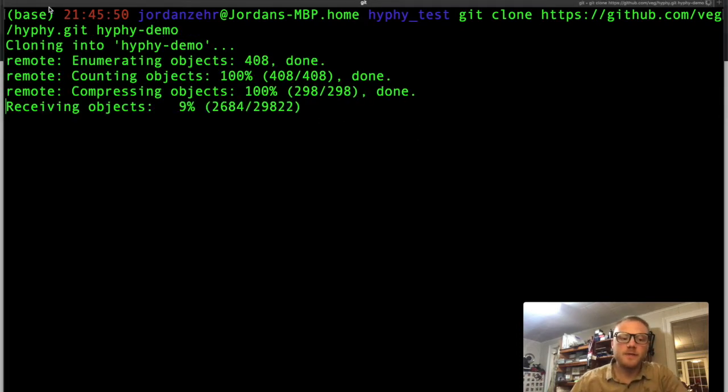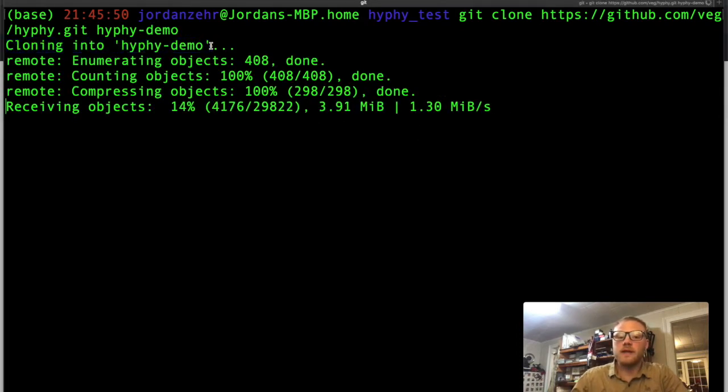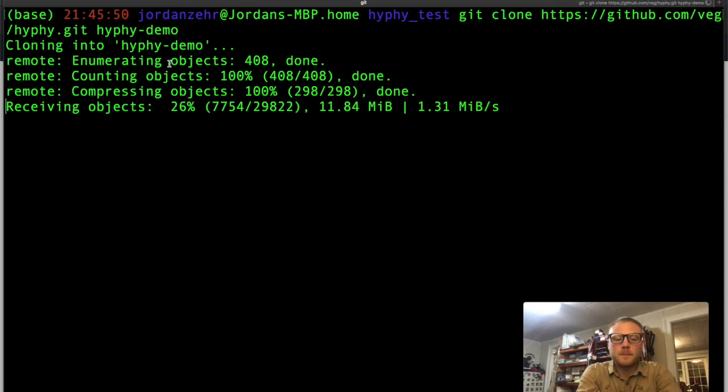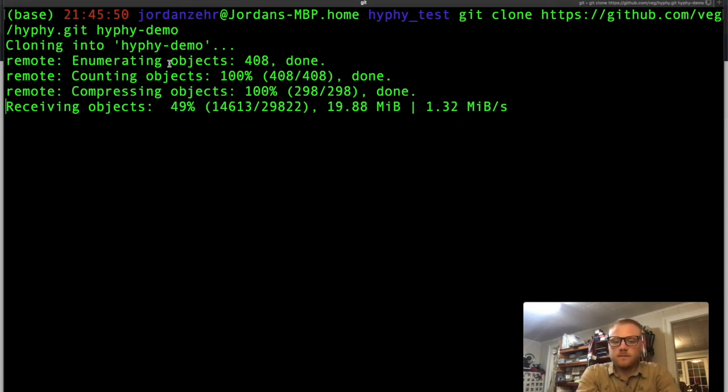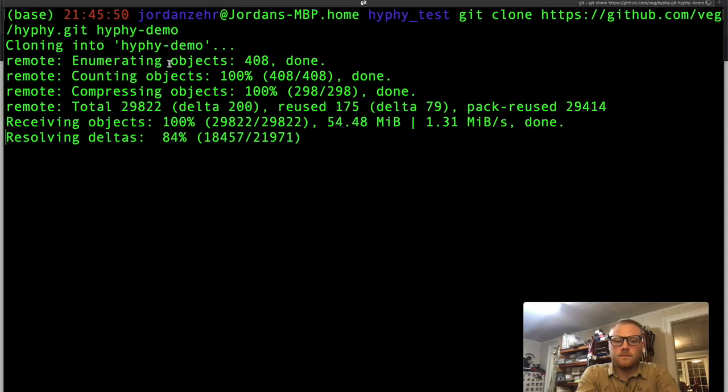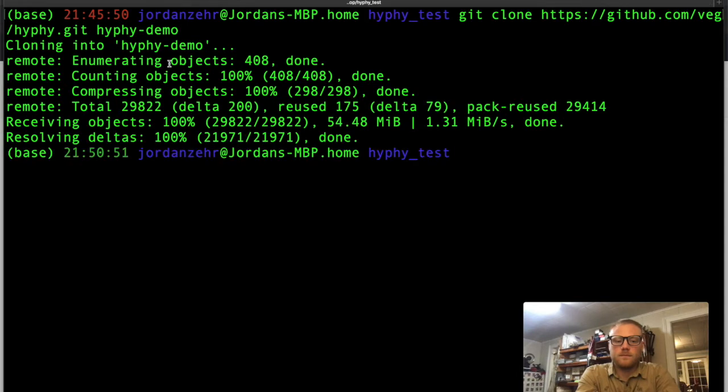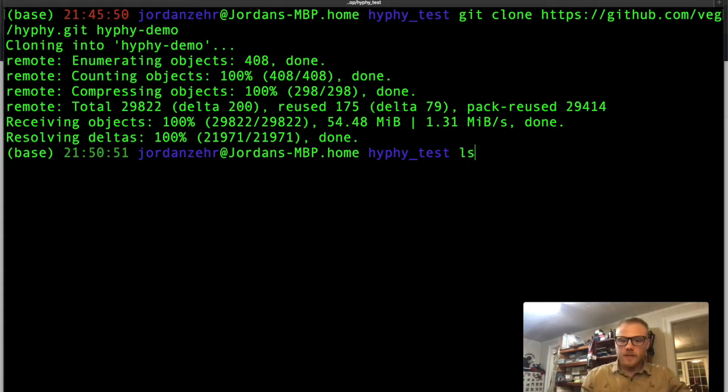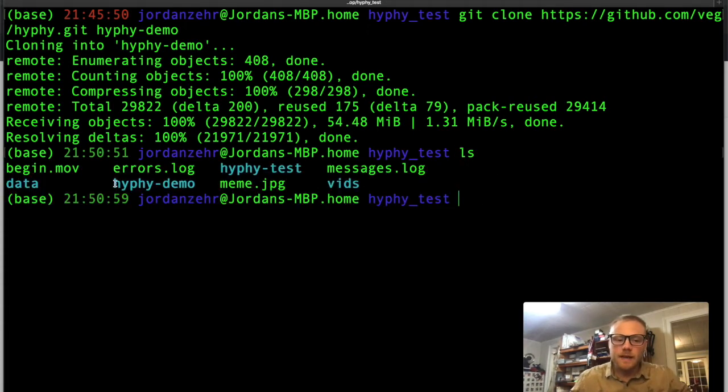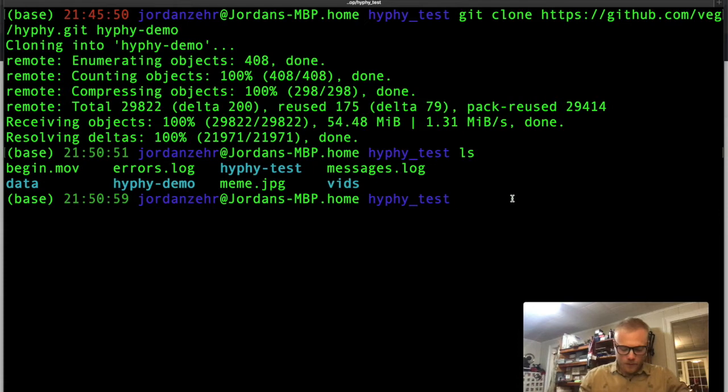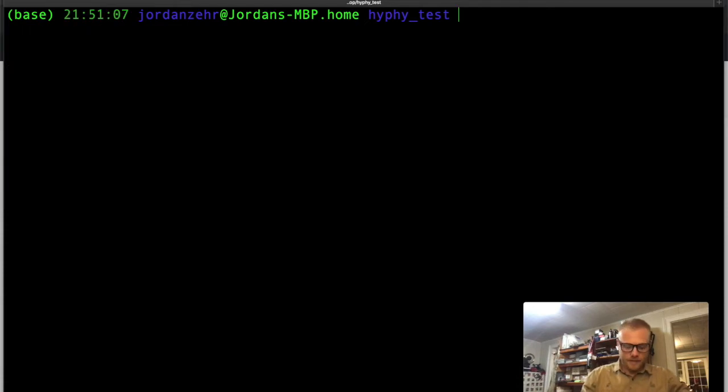And so what's going to happen is we're going to clone that repo right into a directory called HyPhy demo. And this might take a second or two, but that's okay. It'll crunch through. Looks like our repository cloning has gone successfully. So if I just type ls, you see that HyPhy demo, which is the directory that we were cloning into, has successfully been cloned. So what we want to do is cd into HyPhy demo.